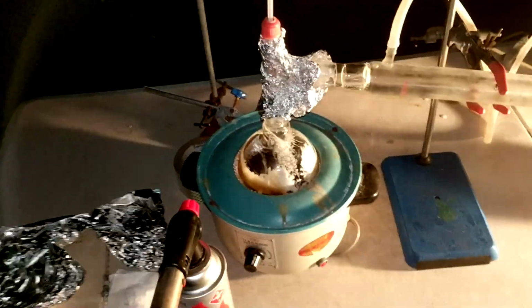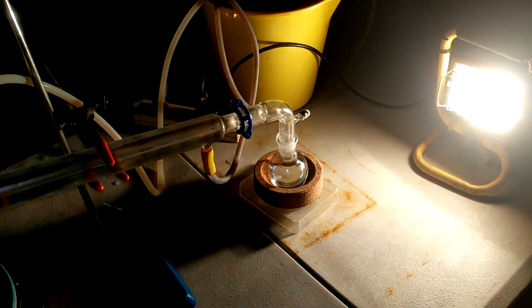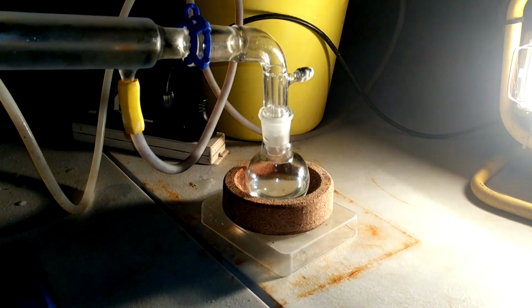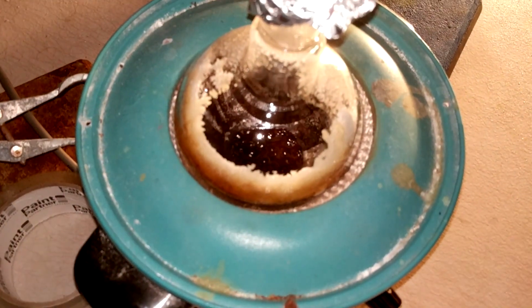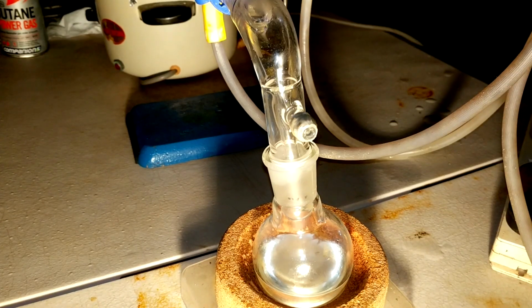Yeah, knocking that stuff back down into the bottom of the flask really does help. You can see the pyridine rate coming over now is quite a bit more substantial. So the drop every couple of seconds, which is a lot better than it was. But we're getting near the end of what's actually left in the flask there. So yeah, I was right in assuming that there really wasn't much actually at the bottom of the flask.